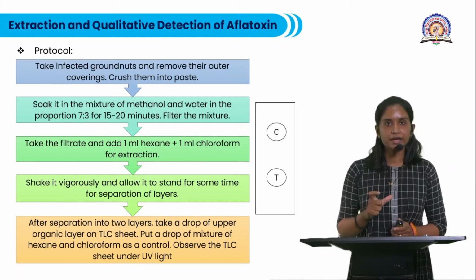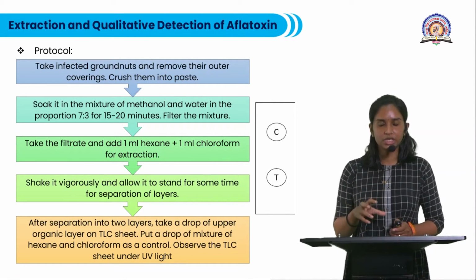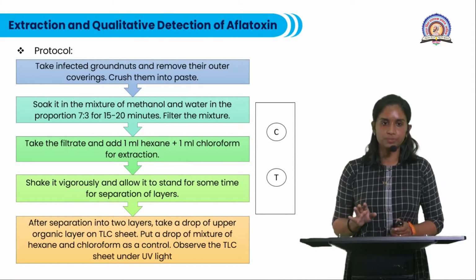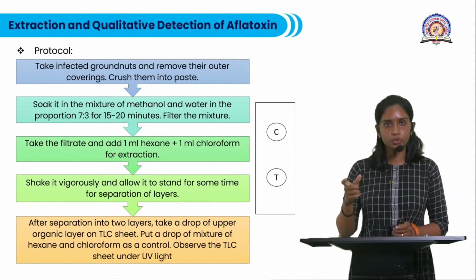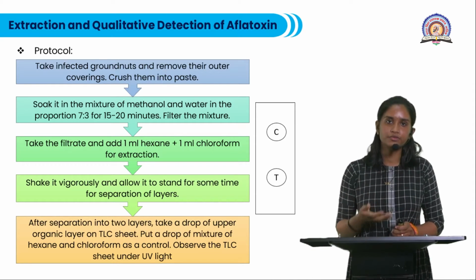This will act as a control, because we need to compare the test with the control to see whether fluorescence is exhibited by these solvents alone, so as to avoid false interpretation. Then you need to observe this TLC sheet that contains both the drops, control as well as test, under the UV light to see whether they fluoresce or not.